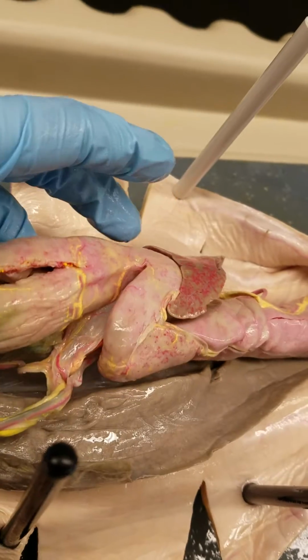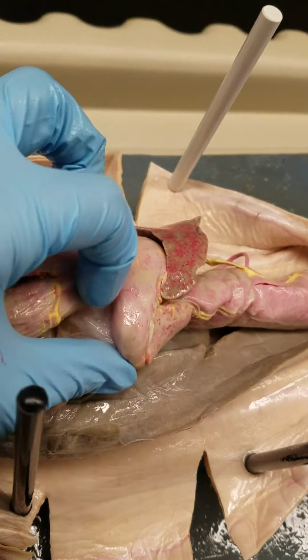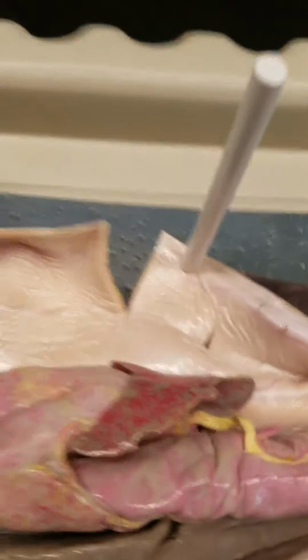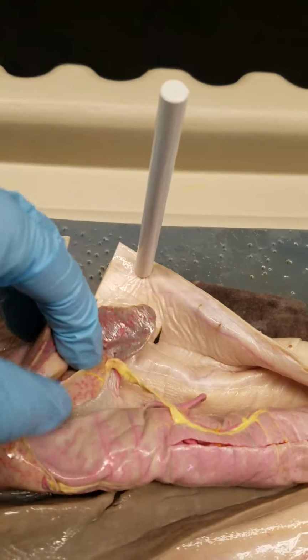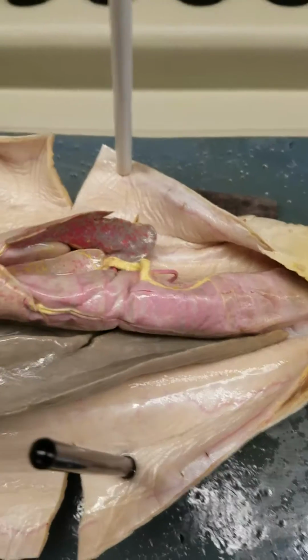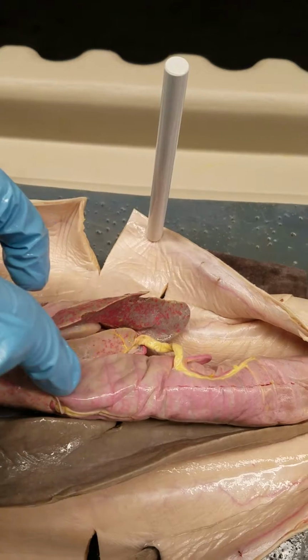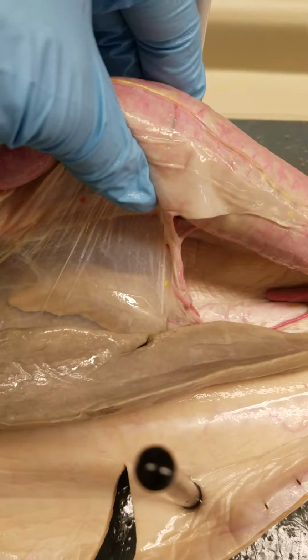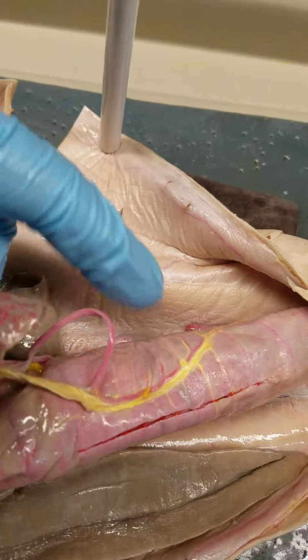So then if you kind of move the stomach away here, you can see your hepatic gastric ligament kind of connecting the parts of the intestine and the stomach. So then under your spleen here, you can move this away to see your pancreas, which is kind of a lighter colored lobe here. So then covering the surface of the organs is going to be your visceral peritoneum. And then if you kind of move your stomach and your intestine up, you can see this mesenteric connective tissue here. Okay, moving on to the intestine.